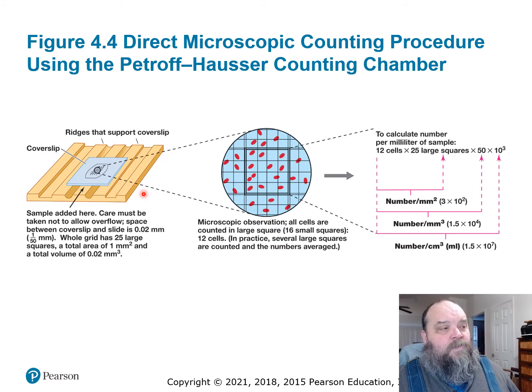In this glass, if you allow the stuff to dry there long enough, you know what? Not all those are going to come off. What happens the next time you reuse this slide to count something again? You end up with some that were from the previous time you counted. They were just stuck there because you only could get 99% of them off the time before that, and it starts to accumulate. Yeah, this is the dumbest thing I've ever seen.